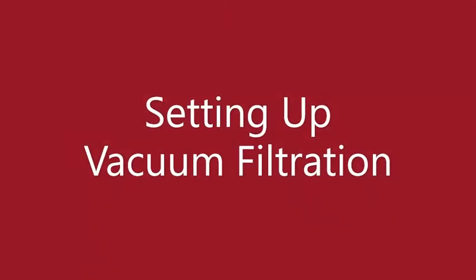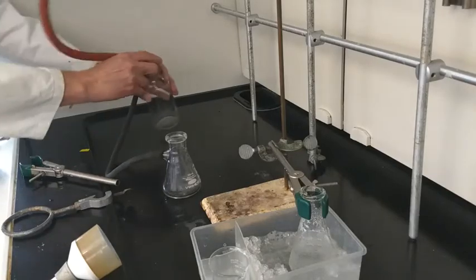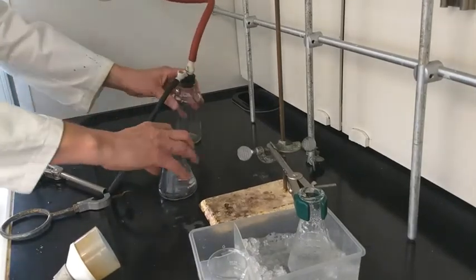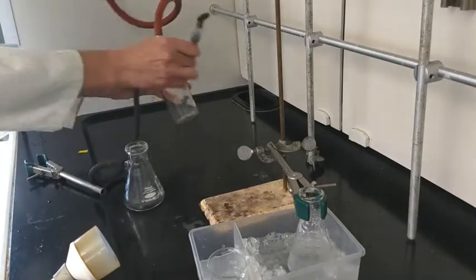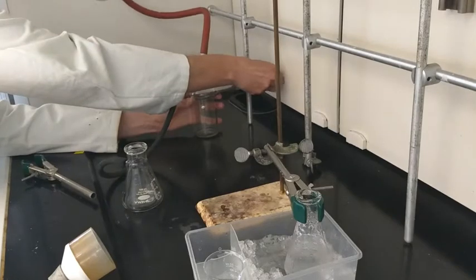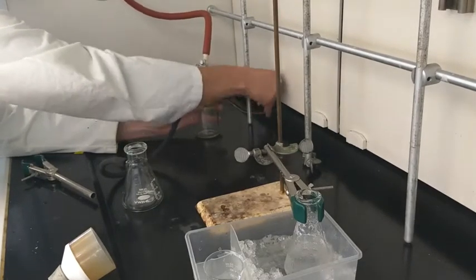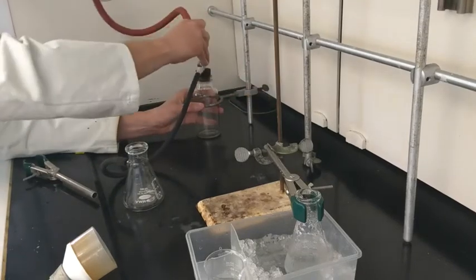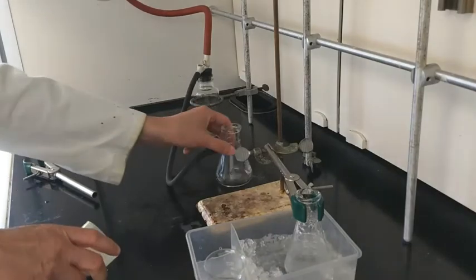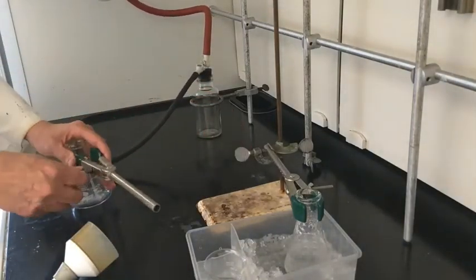This video we're going to talk about setting up the vacuum filtration. We use this trap to protect our vacuum lines, and there are these quick connects on top. You'll want to clamp this up — I like to use an iron ring at the top to make everything stable. The sidearm flask will be top heavy with the filter, so if it falls over it can cause your filter solution to spill and make a mess. So just like everything else, clamp it up and have it nice and stable.